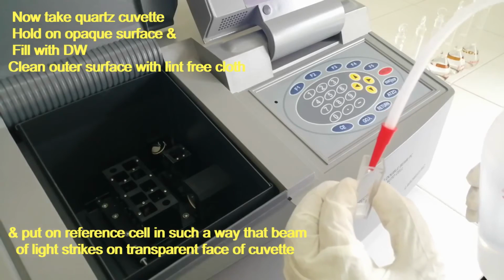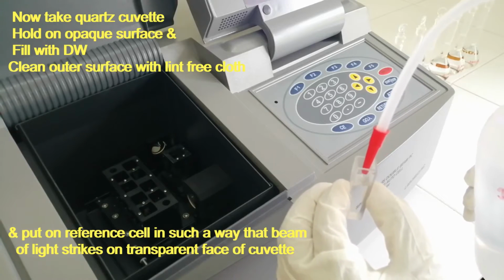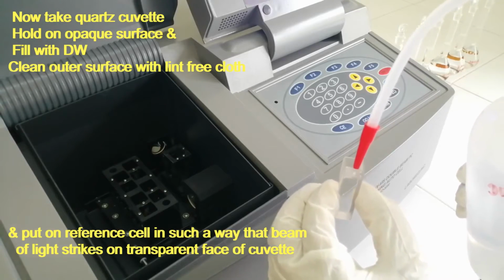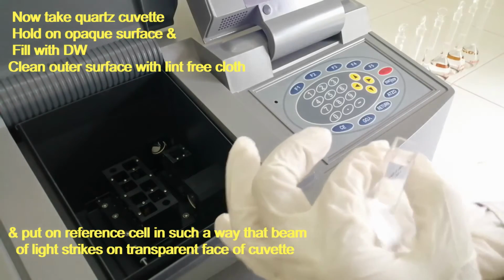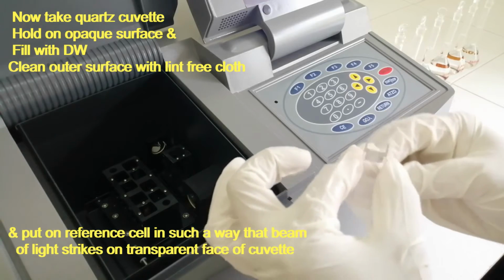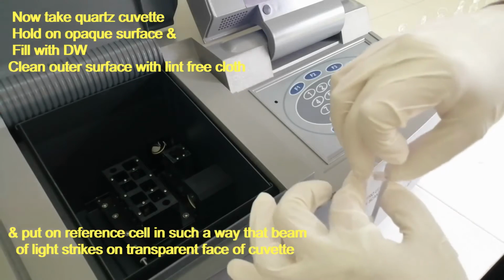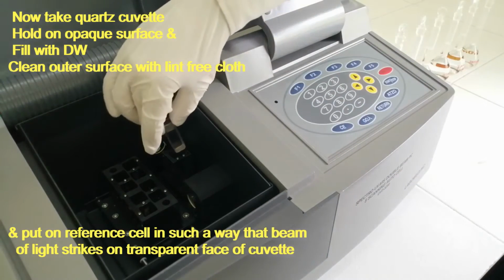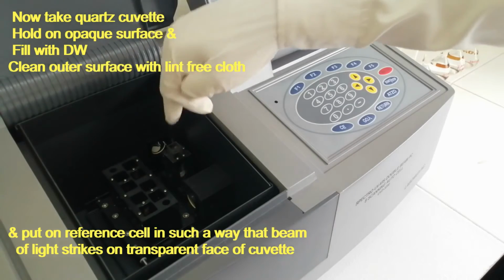Now take a quartz cuvette, hold it on the opaque surface and fill with distilled water. Clean the outer surface with lint-free cloth. And put it inside the reference cell in such a way that the beam of light strikes on the transparent face of the cuvette.